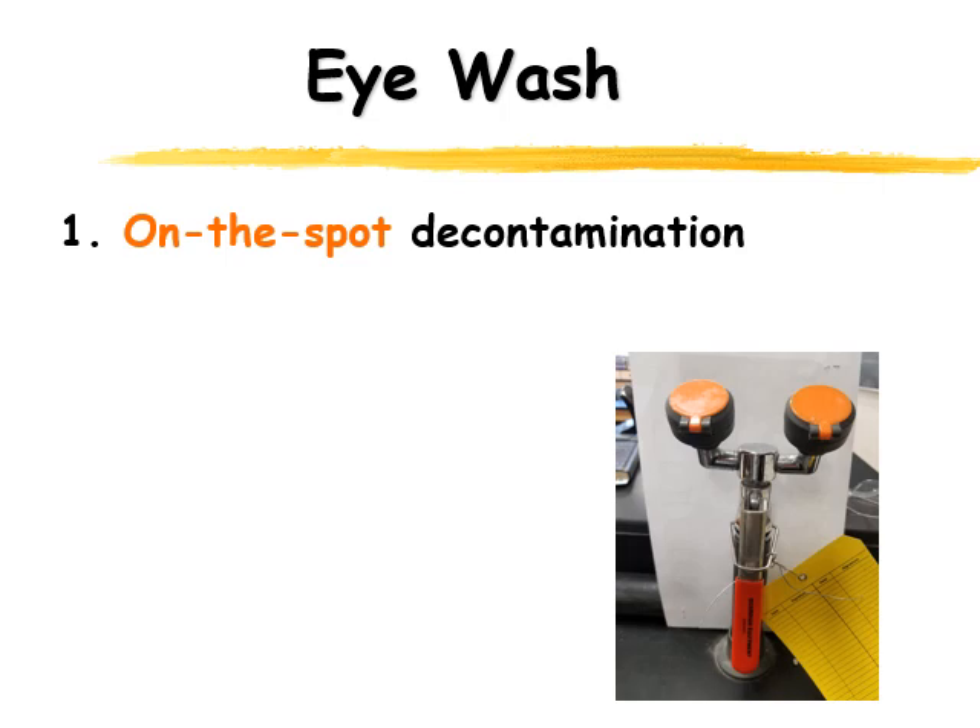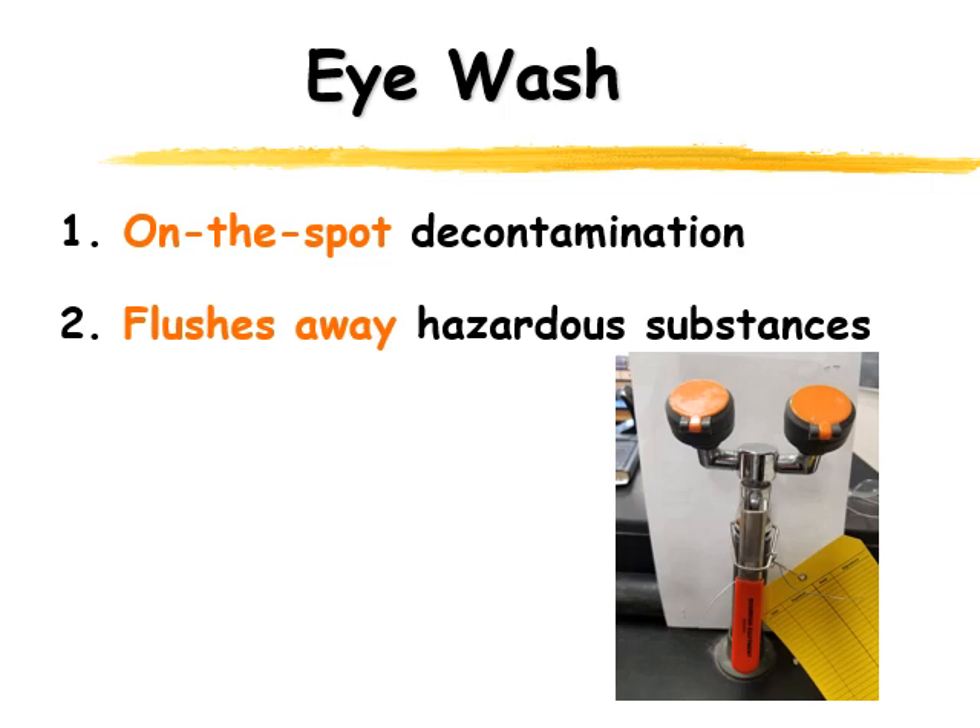There are also eye washes in the back room, so when we're preparing chemicals we can flush our eyes out right away if something happens — you have to do it very, very quickly. Of course, you're going to be wearing safety glasses when we're preparing things, so hopefully the eye washes never actually need to be used. But if they do, we know they're clean and ready to go. They're important to flush away hazardous substances as soon as possible, and they are inspected weekly.